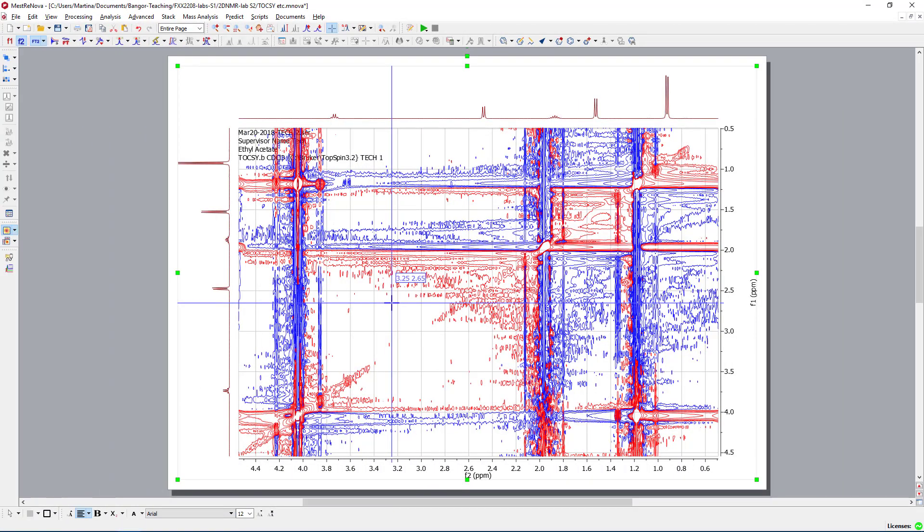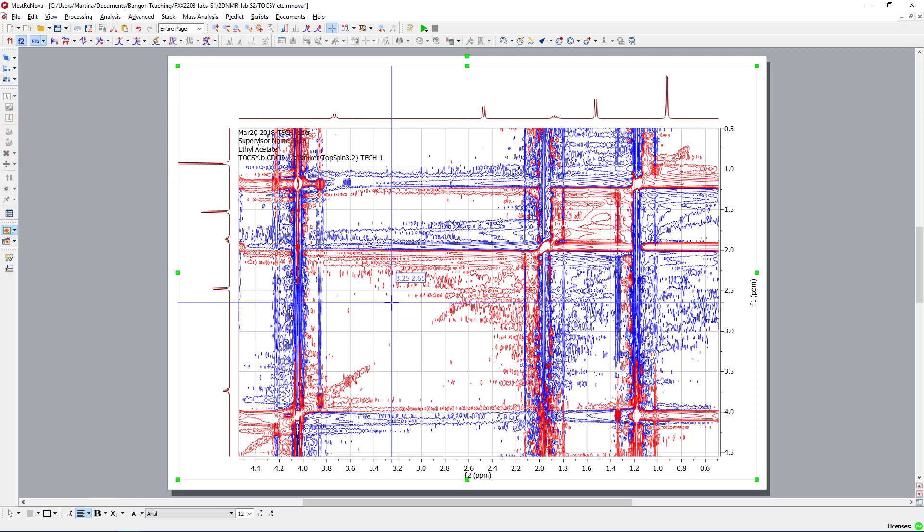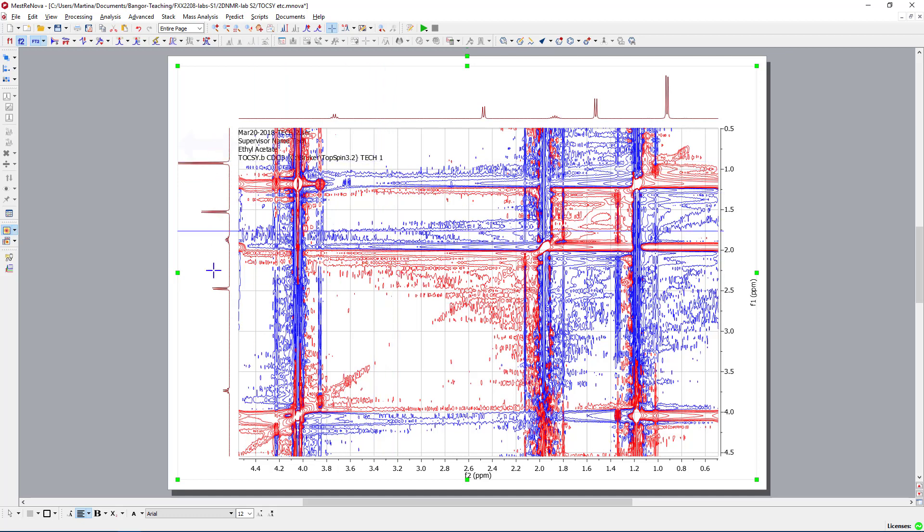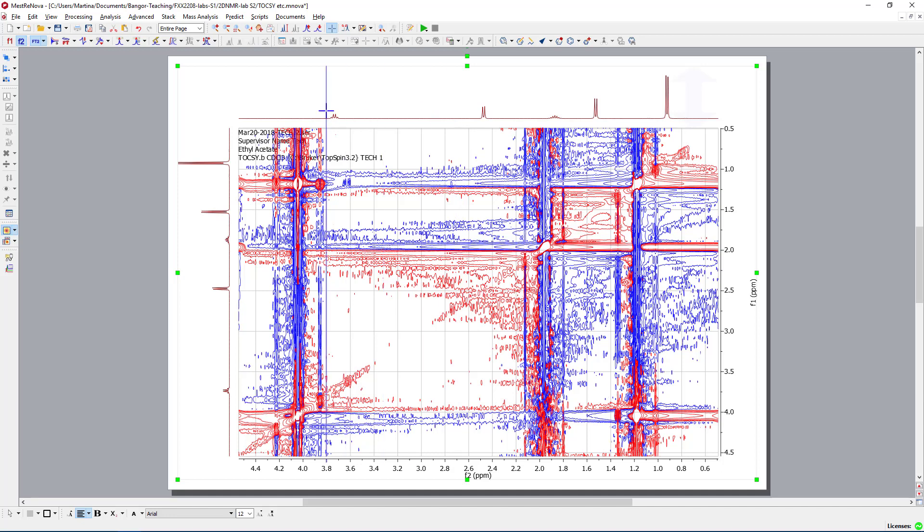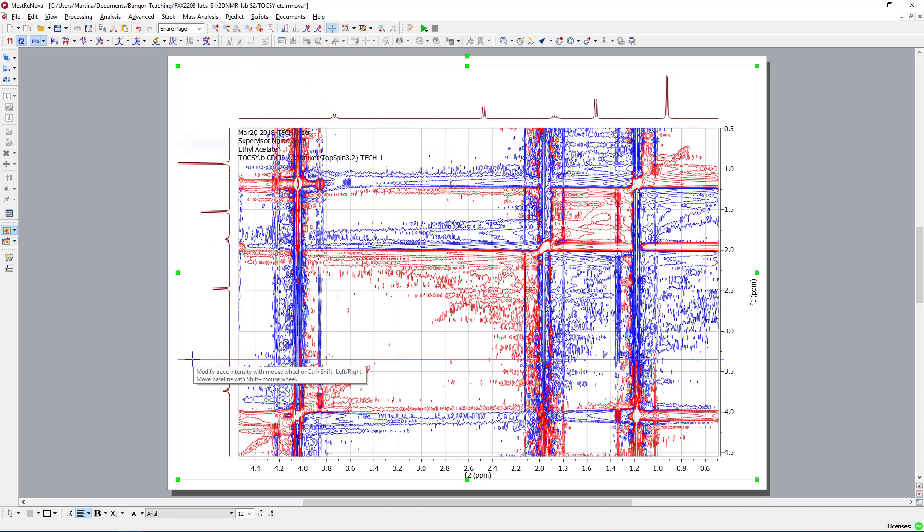Now, let us have a look at the TOCSY from ethyl acetate. When I opened the spectrum, I was faced with something you can see right now. However, MNOVA wanted to be very smart and put some spectra on the side, on the axis, the traces here. However, if you look at those, they don't look like ethyl acetate.